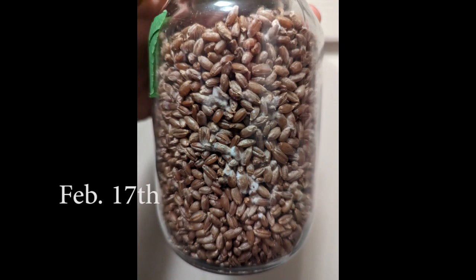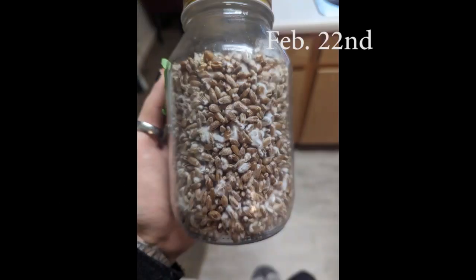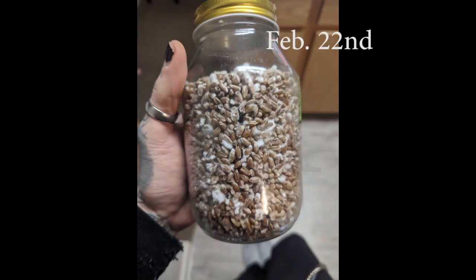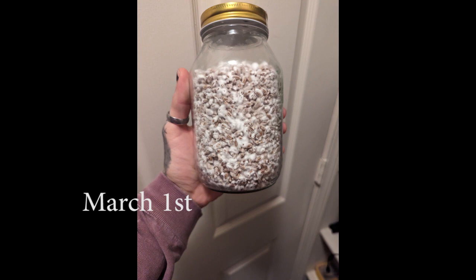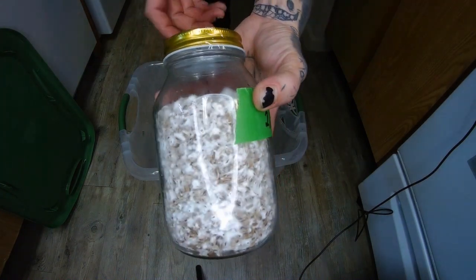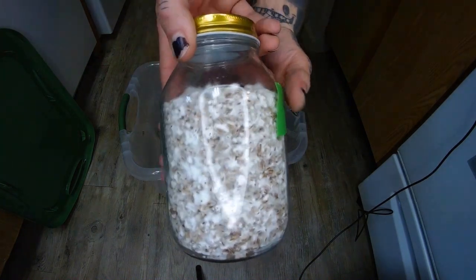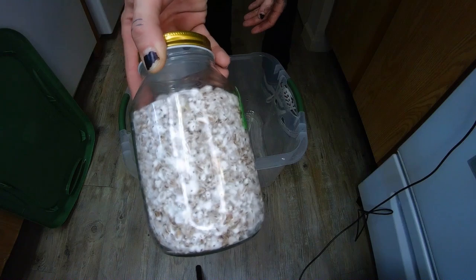Here you can see we're 10 days after inoculation and we do have some mycelium growth — just a little bit on the outside. A few days later and we have much more growth. On the 26th, you can see the mycelium looks super thick. And then on the 1st, it was super healthy, very thick — which leads us to today, the day that we put it into our monotub. Today we are going to spawn to bulk. Super excited — look how thick and healthy this mycelium is inside this jar.